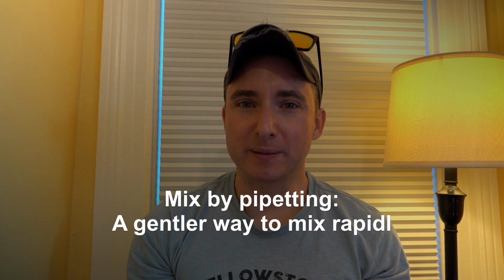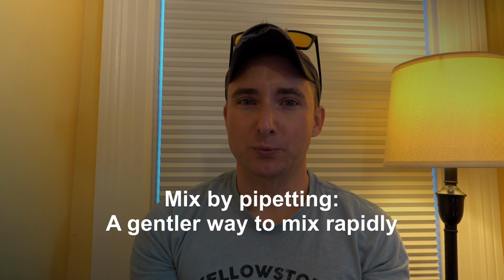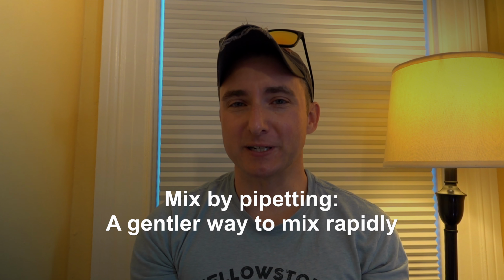The second way that we're asked to mix liquids all the time in these kinds of protocols is to mix by pipetting. And this is where you want to be maybe a little bit more gentle, rapid, but not rushing in your mixture. And this is an area where I see techniques break down. What happens is people become overconfident. Maybe they're trying to show how quickly they can get through a procedure. Maybe they're losing a little bit of focus. But this is where simple, basic pipetting technique goes out the window for many people.